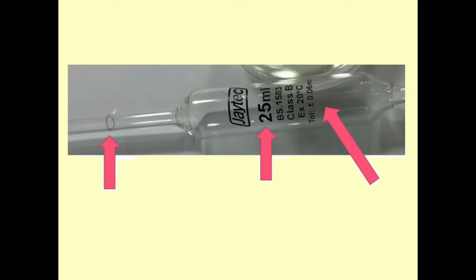So that means that when we are reading it at that line, it could be as high as 25.06 millilitres, or as low as 24.94 millilitres.